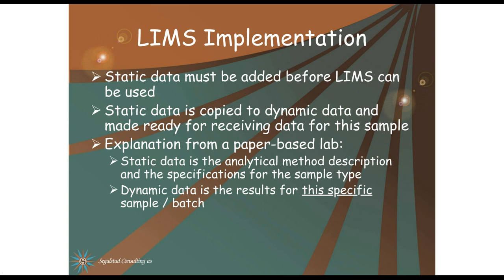The static data are implemented in LIMS, which means added to the LIMS before we can use it for our samples. When that has been done, we can add this sample with batch number and so on, and the dynamic data are created for this sample.